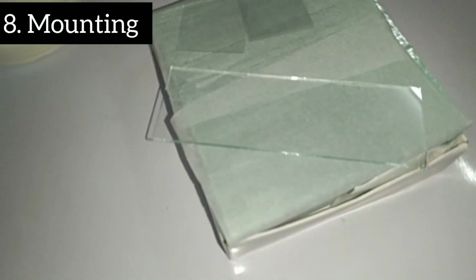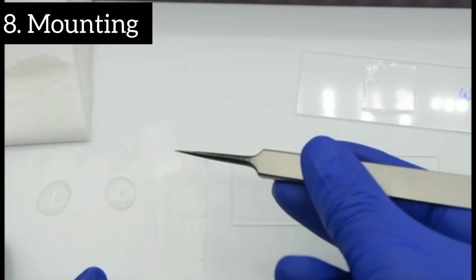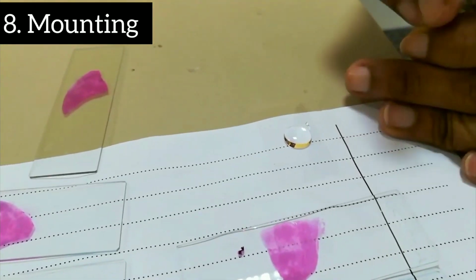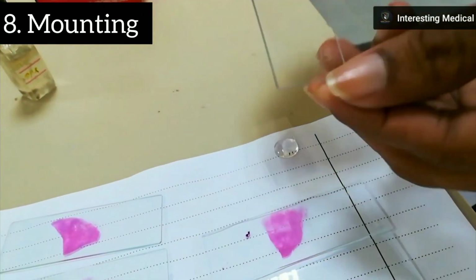After staining, the slide with specimen should be mounted. Mounting is the process of securing cover slip on top of a tissue slide section. The purpose of mounting is to protect the tissue section from damage and thus facilitate handling of the slide and extend storage indefinitely.